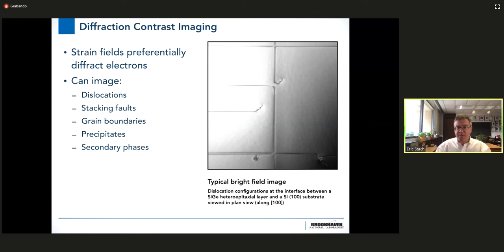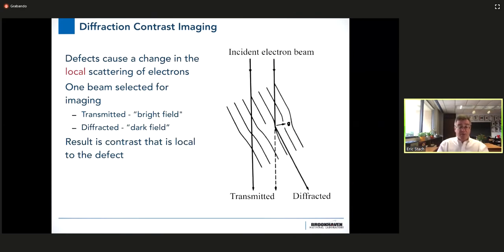So just to give you a bit better sense of that, a dislocation, right? It's a defect that allows crystalline slip. Here's a model of a dislocation. It turns out that a dislocation is an extra half plane of atoms that are present. It has a core, right? That black line that you were seeing was reflective of that core. And when you do deformation in a crystal, what you're doing is you're basically shearing a material, and it turns out it's easier to flip those atoms over at that extra half plane and propagate that than it is to move or slice through the entire crystal. And so plastic deformation occurs by the motion of dislocations.